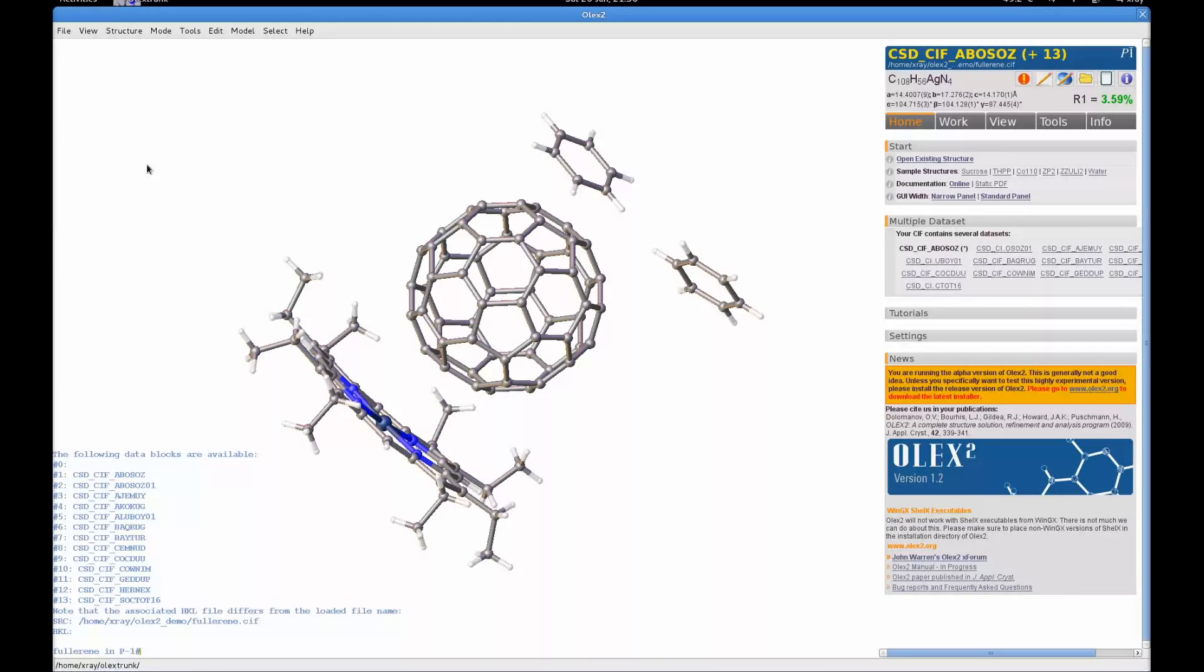Crystallography is not just about making pretty pictures, it's also about analysis of the structures. We want to know about things like bond lengths, angles, and interactions of planes. To do that in Olex2 we use the commands cell, ESD, and mplan. Since they're all sort of related, I'm going to clump them together into this bite-sized recording.